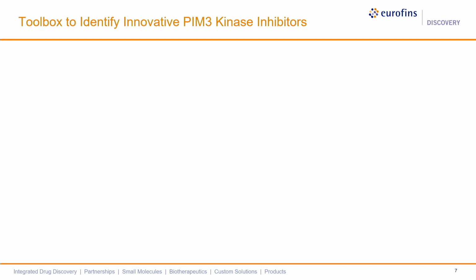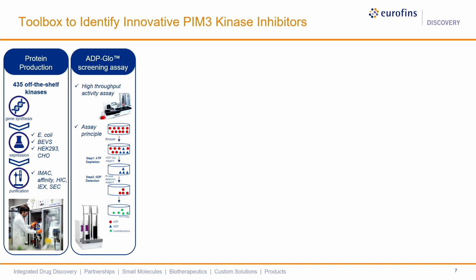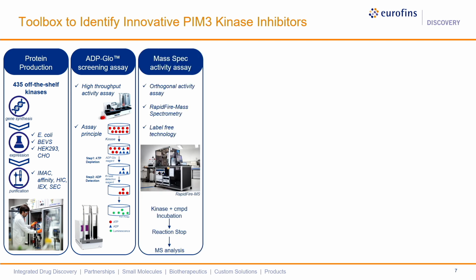As you saw, there is plenty of color corresponding to different assays, and all of the assays are combined within a screening cascade. But it's important to have the right tools to be efficient and have good data. For this project, we used our protein production quality. You need high quality protein for any biochemical approach. We also developed a primary screening assay using ADP-Glo, the gold standard for HTS for kinases. We also developed a mass spec activity-based assay as an orthogonal readout to confirm the activity of the hits.